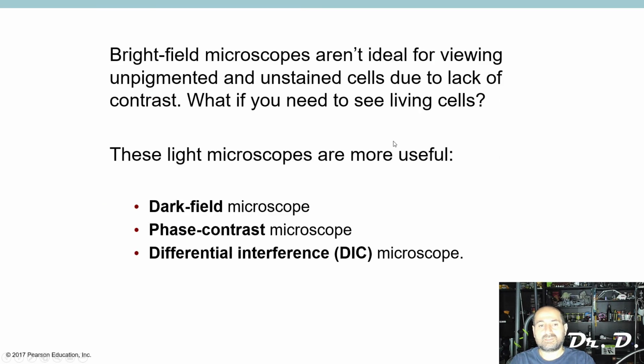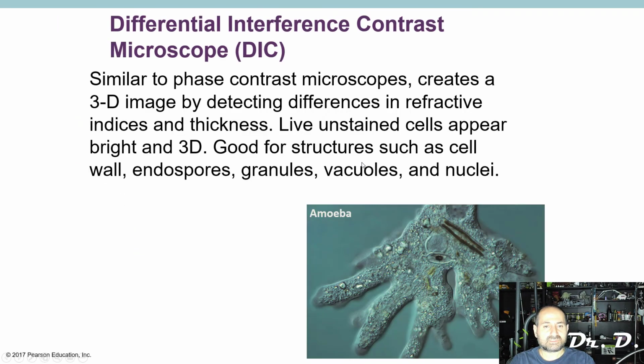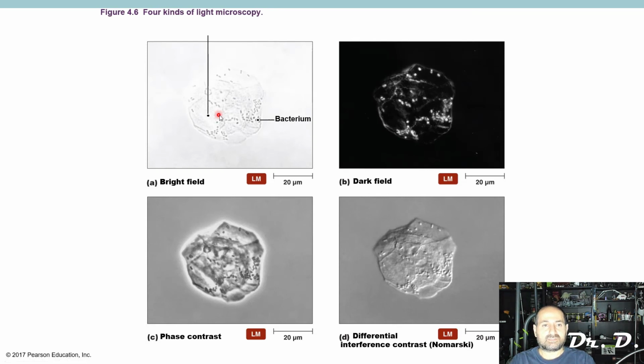So you know what you would see? You would see something like this. This is a pale cell. This is a pale cell with bright field. You see how this bright field cell is so pale and the contrast is really bad? You can't really see the cell. If I were to switch it to dark field, look what I see. I see nice contours now. I see a nicely lit cell against a black background.